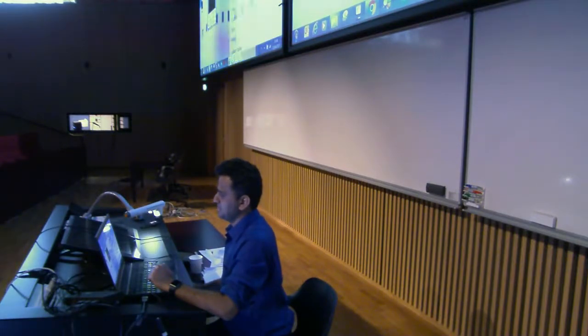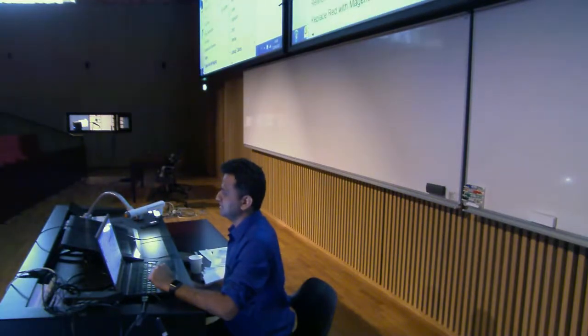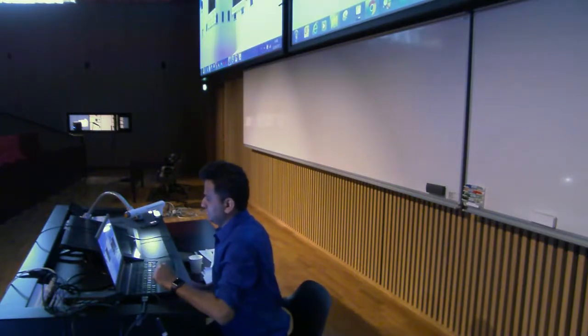So just go to Stacks, Z Project, and say maximum intensity. Now you see here, the Z slide bar has gone. It's only the maximum intensity projection now for all time frames and the different channels. So you can actually go and say Color and then Split Channels. Now you have the time points for every channel. This is all about the visualization.